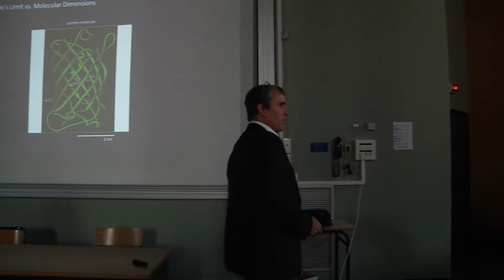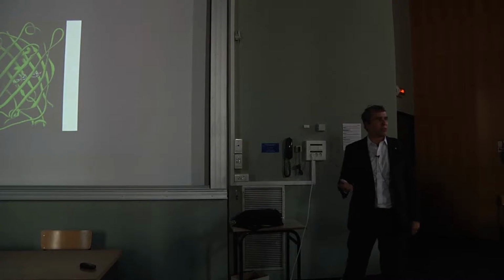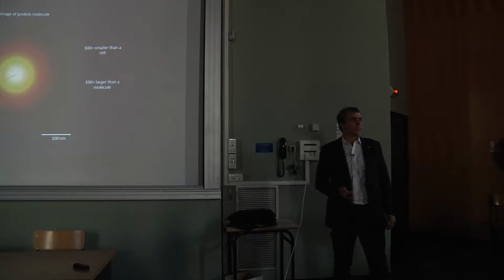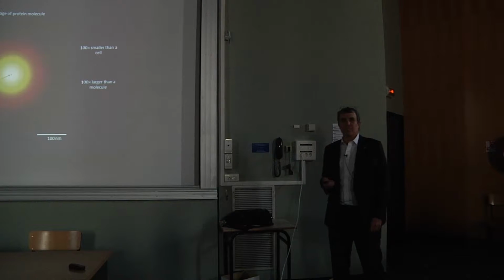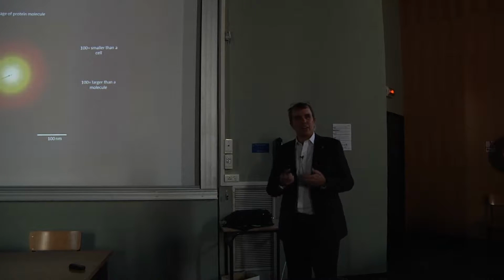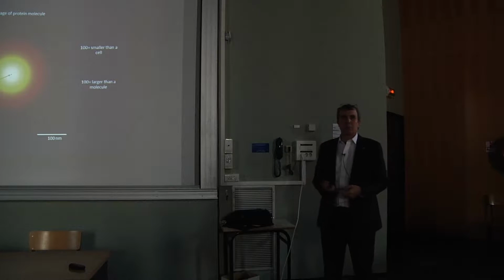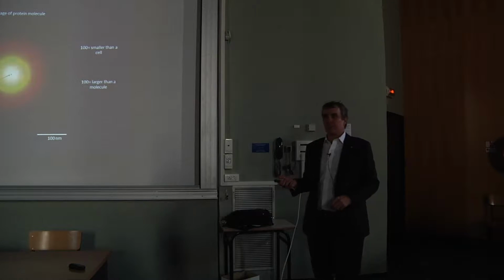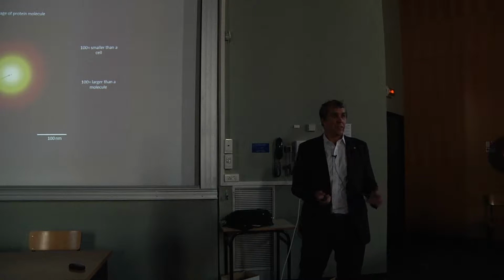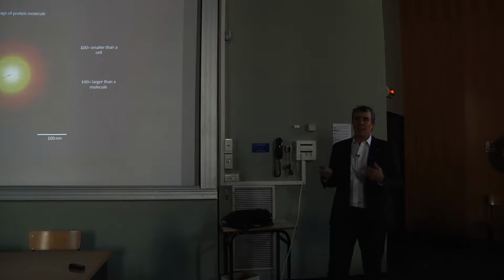So a large part of my career has been working on the problem that if that's the size of a protein molecule, then when you look at it in a regular optical microscope, what you see is that big fuzzy blob. On the one hand, this is bad news because if we want to understand how inanimate molecules can assemble to create an animate cell, it's too coarse by about a factor of 100. But on the other hand, it's good news because that fuzzy blob is still 100 times smaller than the cell itself.